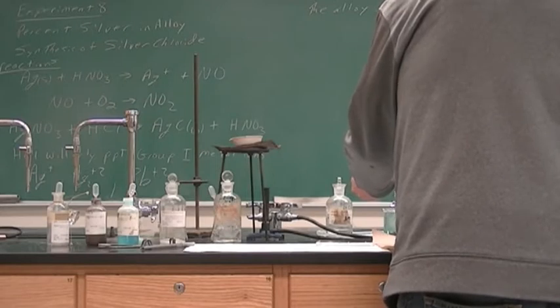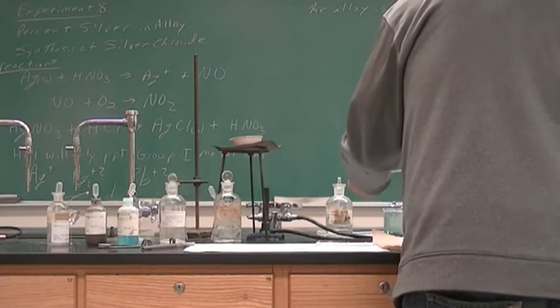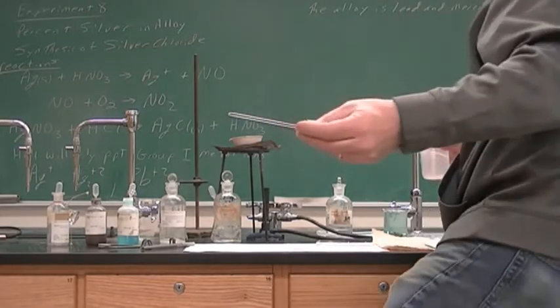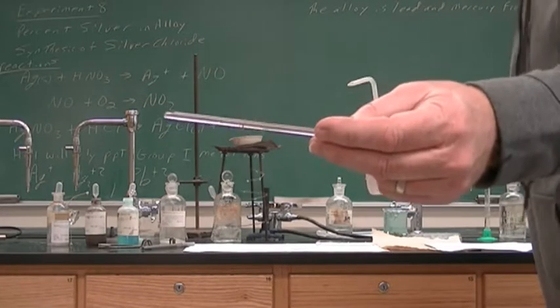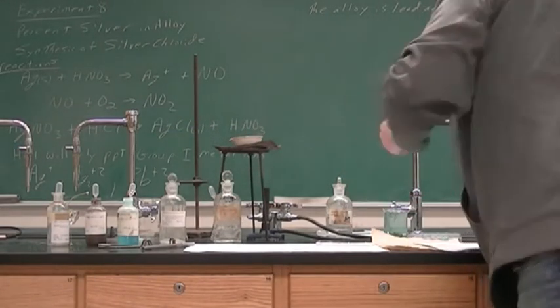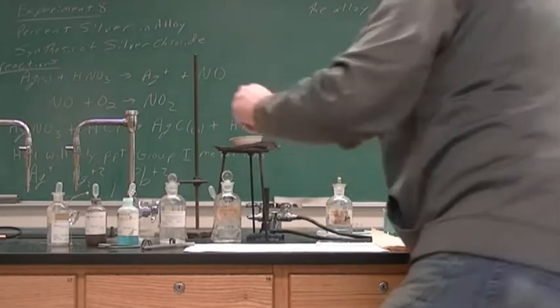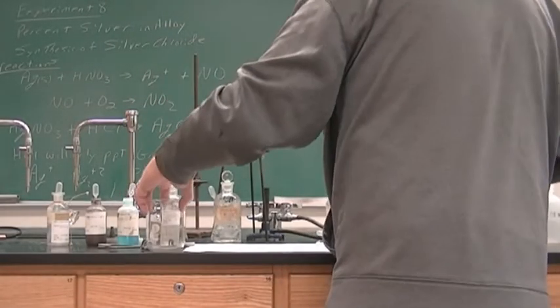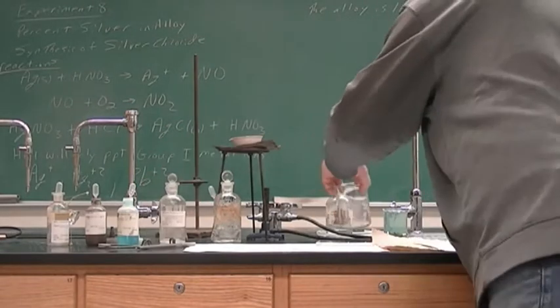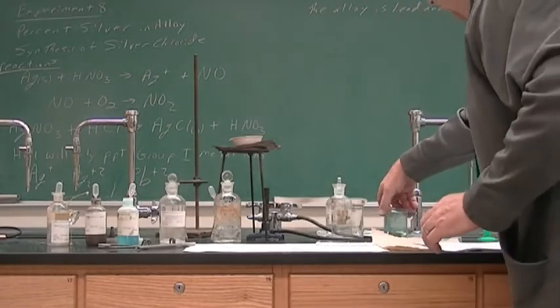And so we are going to have some error, as always, when we do our labs. All right, and so I have the copper coil. We still had plenty of copper left for that to precipitate. All right, and then I'm going to decant this. Decant again means I'm going to pour the liquid, and the solid will remain inside of the beaker.